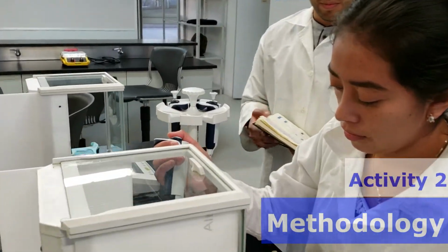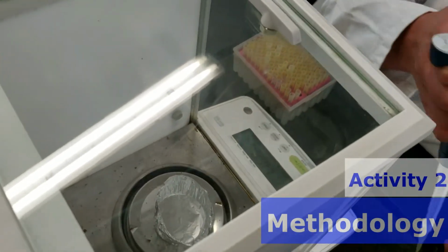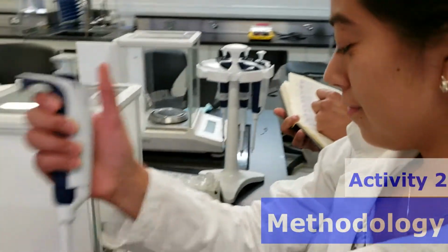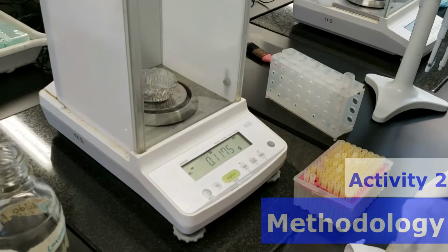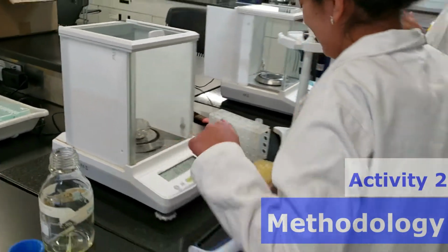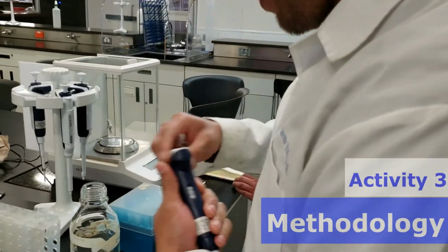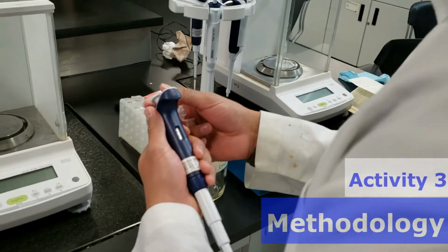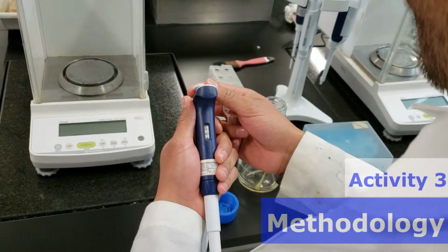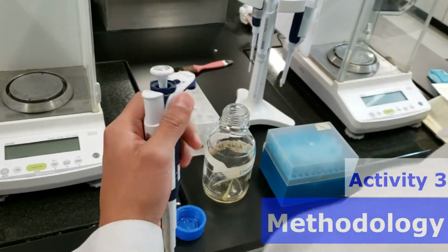The volumes were recorded by repeating the measurement 10 times and taring the scale each time. It is repeated 3 times for each micropipette with the 3 different ranges in the corresponding micropipette. The second activity consisted of applying good pipetting practice and analyzing the accuracy of the micropipettes. It was critical to adjust the volume correctly in order to minimize the error in the measurement.